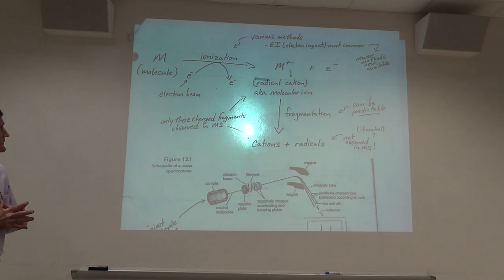Mass spec, any questions about what's going on when we do a mass spec? The instrumentation, process, any questions about that? Go ahead, Mena. What was the standard value for alcohol? Was it 29? Or was it 30? It's 29. Well, if it's CH3, CH2, that would be 29. Two carbons and 5 H's is 29.